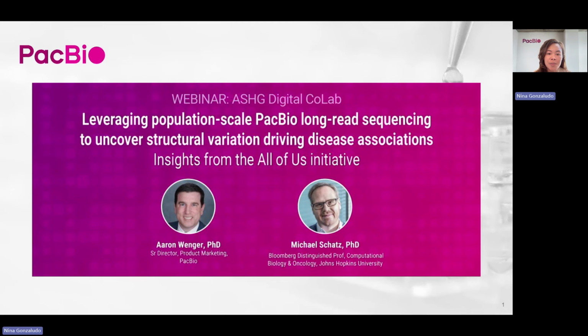This webinar will address how leveraging population-scale PacBio long-read sequencing can help to uncover structural variation driving disease associations with insights from the All of Us initiative.